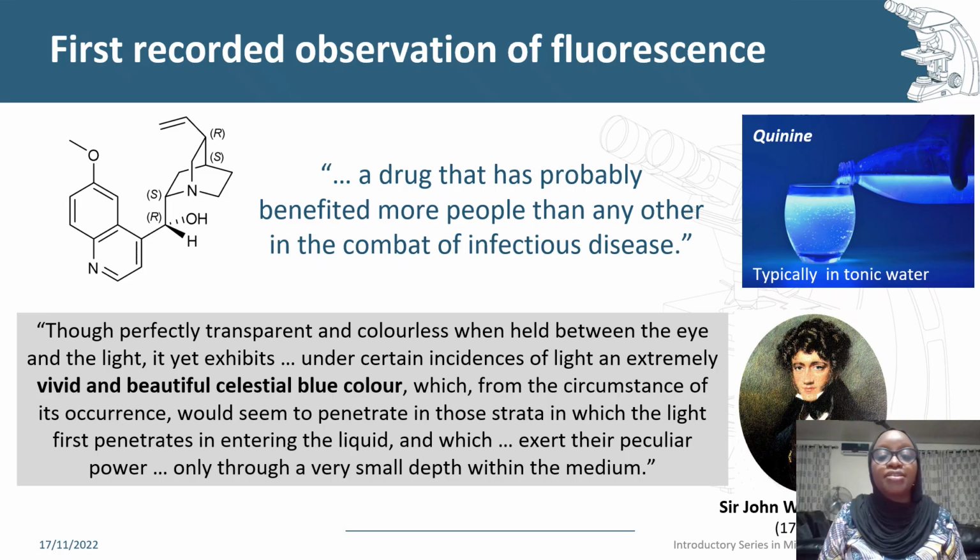Under certain incidences of light, quinine was seen as a vivid and beautiful celestial blue color, which from the circumstance of its occurrence would seem to penetrate in those strata in which light first penetrates. He was a mathematician, a chemist, and a photographer.